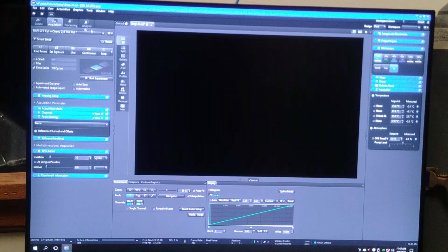So that is a basic overview of the software. I hope that this will be helpful. When I do some more work, I will set up some more videos.